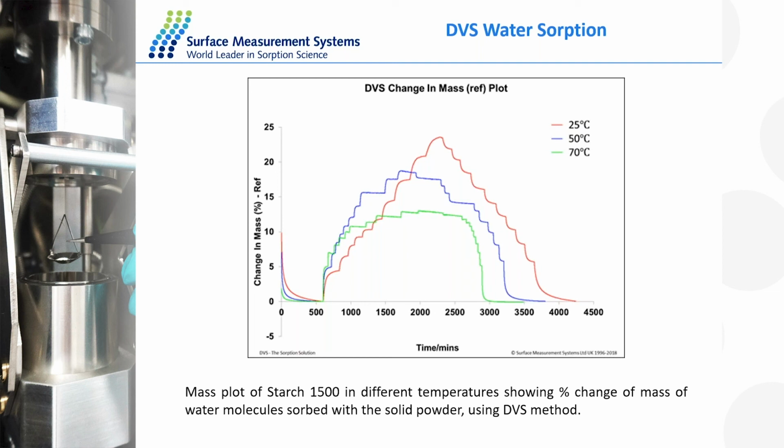Well, as a function of temperature, it all depends on the nature of the material. But as you say, for pharmaceutical materials, you would mainly work at room temperature. When we put materials up on stability, we usually measure the isotherm at room temperature, 25C. But then if the samples are put up at 30C or 40C for stability testing, the isotherm would presumably change, but how much of a change? Is it a significant change? I suppose that's a kind of loaded question.